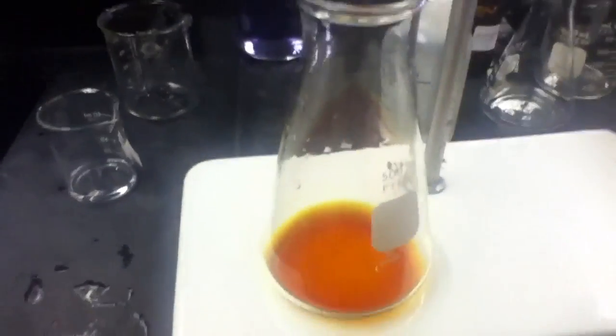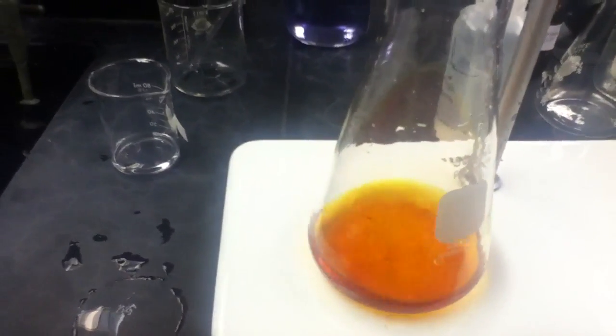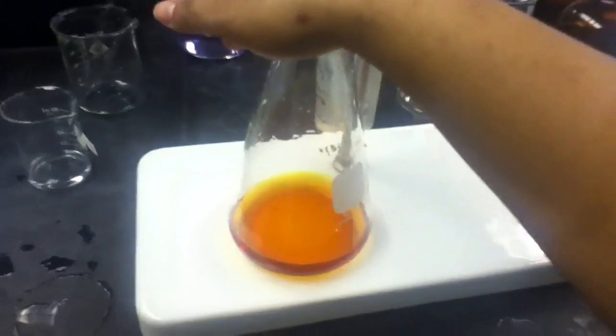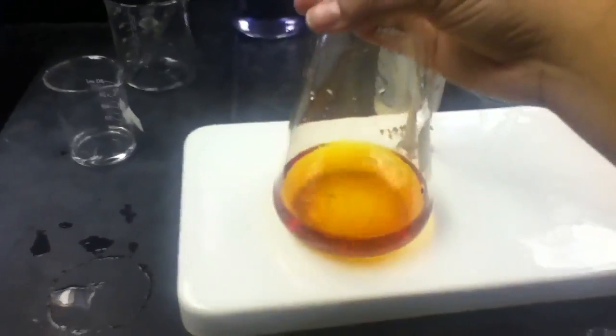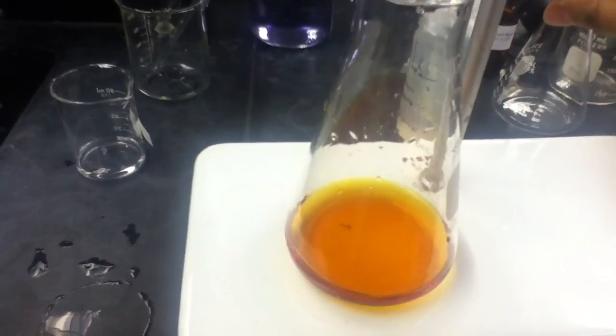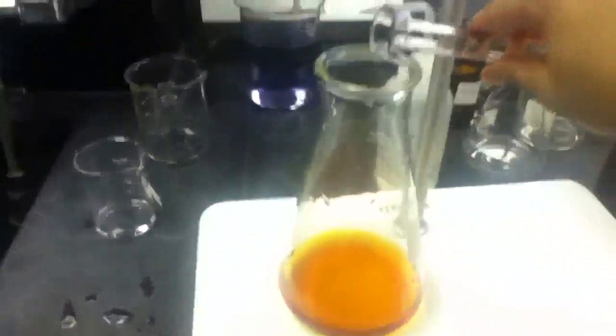I need 50 more liters of water. That took more than a few seconds — completely dissolved. 10 milliliters of 3.0 mole.